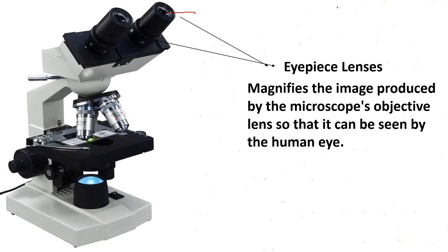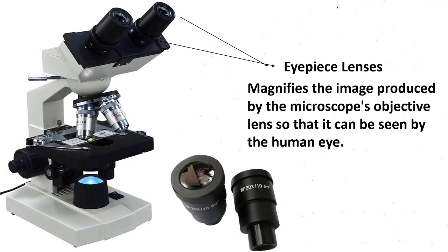Let's continue. Let's look at the next thing that I want you to understand. This eyepiece lens also comes in different magnifications, so it is removable. You can actually remove this eyepiece lens and change it to whatever magnification you want.